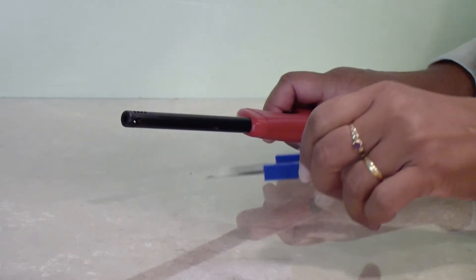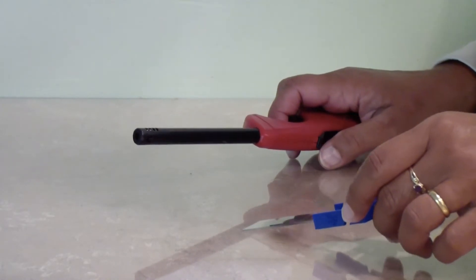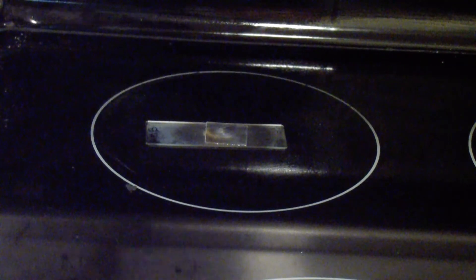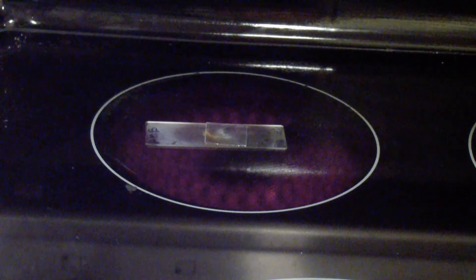One method is to use a gas lighter or lit match to heat the slide for two to three seconds. The other is to use a cooking element. Put the slide on a cold element, turn the element on just for a couple of seconds and turn it back off. The heat reaches hundreds of degrees and kills any living organisms.